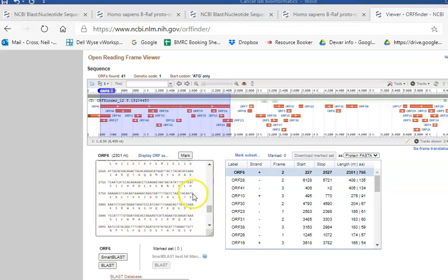So this is effectively telling us the DNA sequence that codes for, when copied, forms the mRNA, which when translated gives us the amino acids around amino acid 600. Now, just as a final check, I would want to see some of this DNA sequence in the middle of our PCR product. So what I'm going to do is a little check to make sure that this sequence is actually within my PCR product.